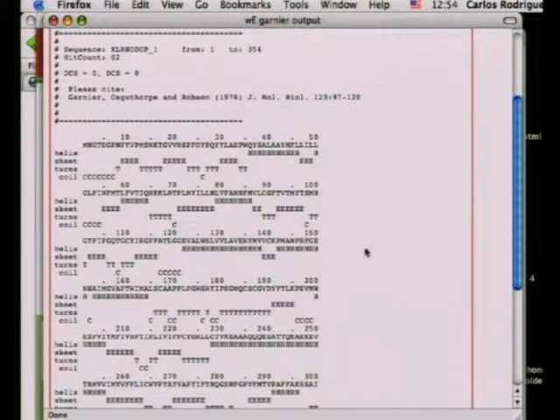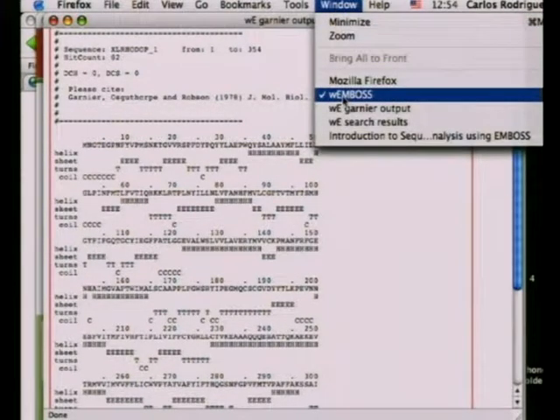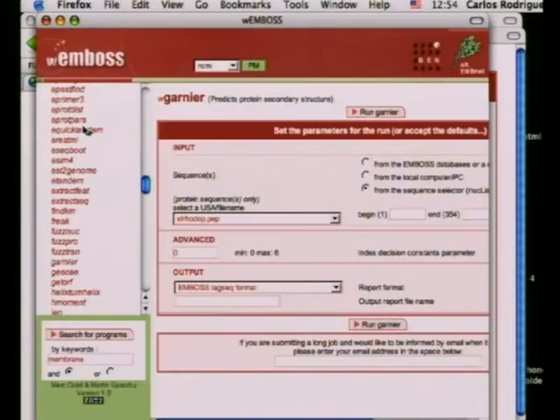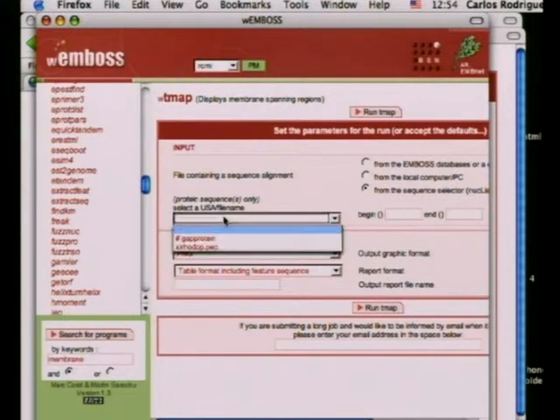There's some nice chunks in this protein that were really hydrophobic, so you can ask what happens. Wonder if this is an actual transmembrane spanning protein.